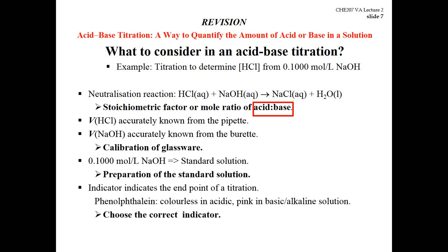We see that we relied on the indicator to determine the end point of a titration. So it is also very important to choose the correct indicator.